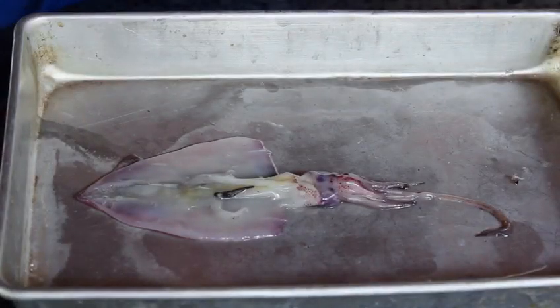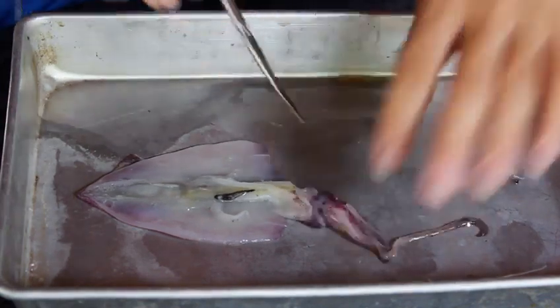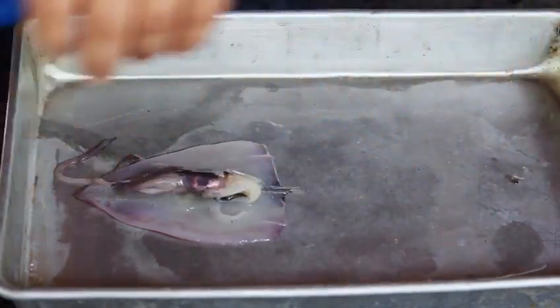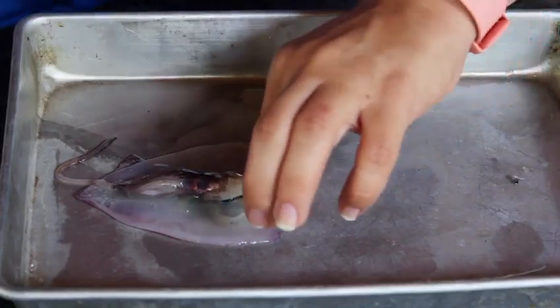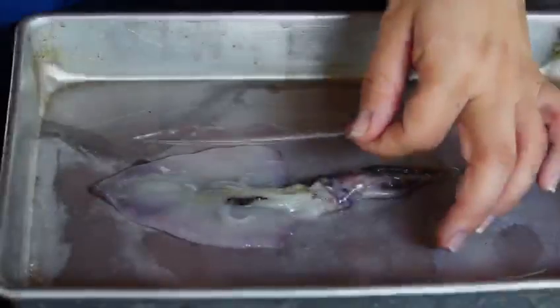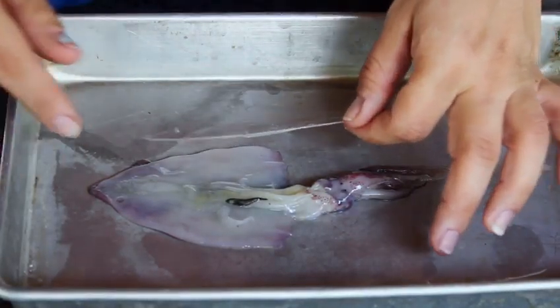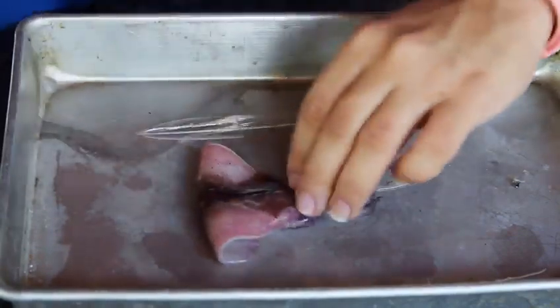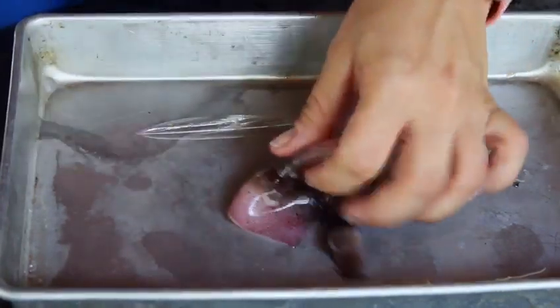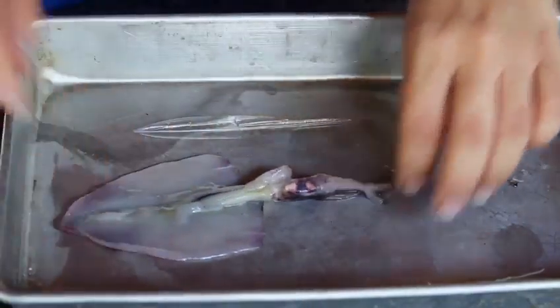Our squids are invertebrates, meaning they don't have a backbone. A long time ago they used to have a shell, similar to our nautilus, but they have adapted to not need it, and have maintained a part of it called their pen. The pen is responsible for keeping all of their organs centralized and upright. If we remove the pen, we can fold this squid in half, and in half again, and nothing really changes — the piece remains intact.